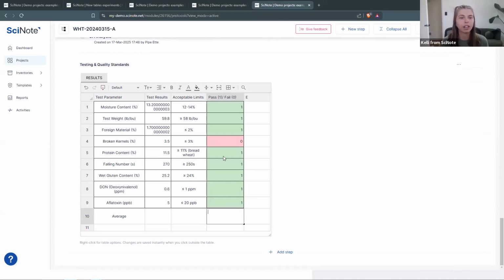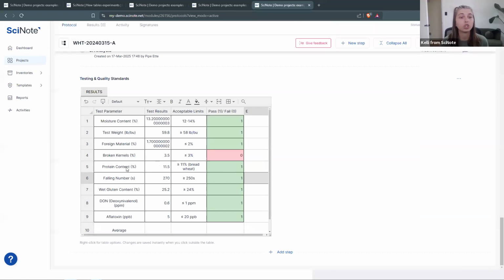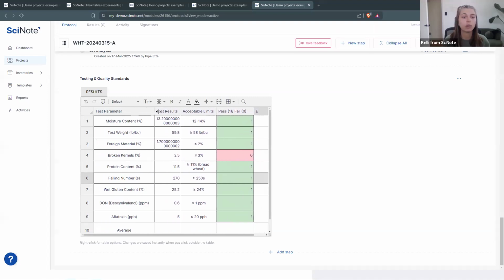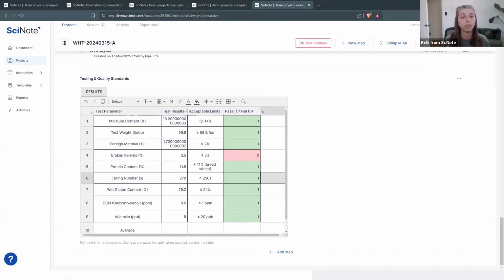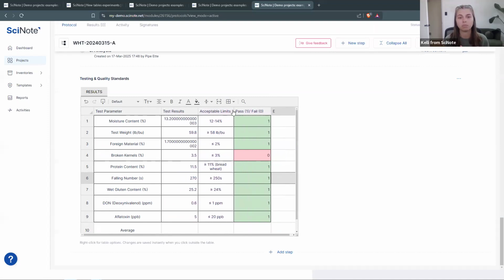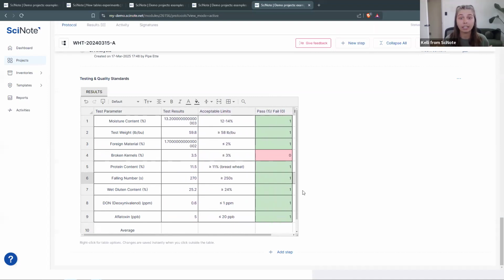For starters, my columns can become too narrow when you're creating a header. So as Alenka is showing here, you can put your mouse in between either the columns, and when you click and drag, it can extend the column's width or decrease it depending on your needs.